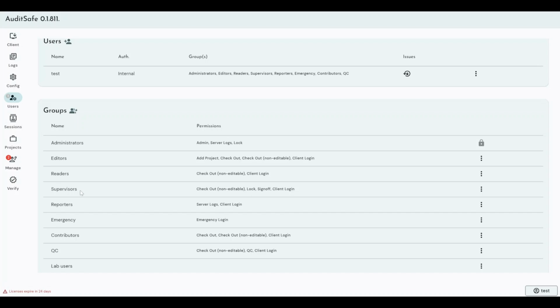In our previous software, you would have to configure all of that manually for each single user, but now you can simply assign the users to the groups that you want to apply the permissions to, and they will automatically gain the set of permissions relevant to that group, which means that anyone with say the supervisor permission, they've all got the same level of access, they've all got the same permissions, that's all one group.